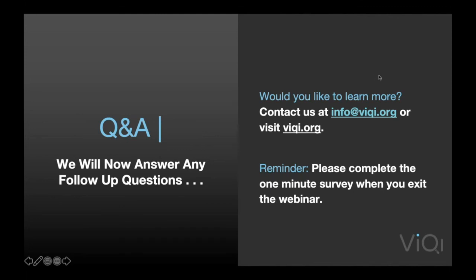You don't know, but there's a way to measure if you got enough, and that's the training curve. So typically, if you have a situation where you can tell the difference between the things that you're trying to classify, so in other words, just by looking at them, you can distinguish the different things you're looking for, for feature-based AIs, a few dozen samples is certainly enough to get started and to run the experiment, if you will. In cases where you can't tell the difference, a few dozen is probably not enough. You probably want 100 or more, or even a few hundred samples.